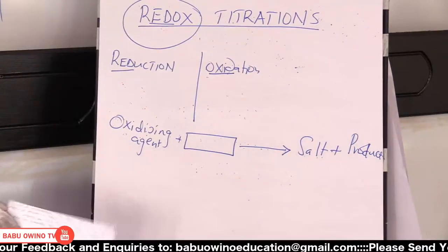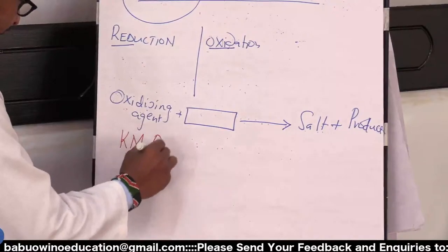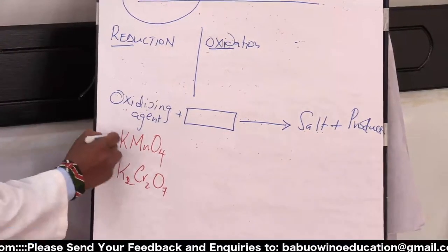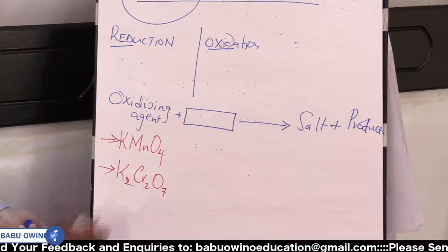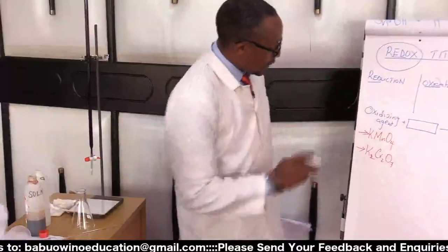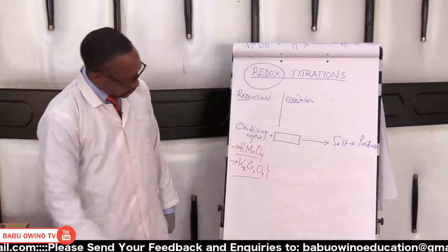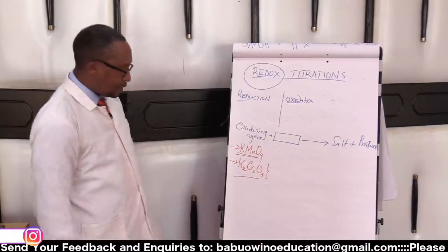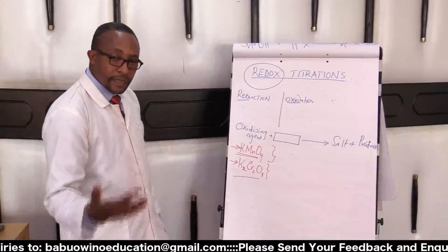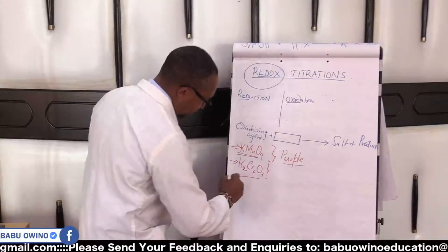So how do you go about this? Now, some of the oxidizing agents that we have, we can have potassium permanganate. We can have potassium dichromate and others. These are the common ones. Remember, these ones are colored. So in the previous exercise that you have seen, the examiner used different indicators, phenolphthalein and methyl orange. In this case, you will find these are colored. Unlike in the case of the dichromate, where we can use diphenylamine indicator, in the case of the permanganate, we don't really use an indicator. Why? Indicators are used to tell us the endpoint. The two products have combined. So in this case, this is purple. Some people like working it like that.